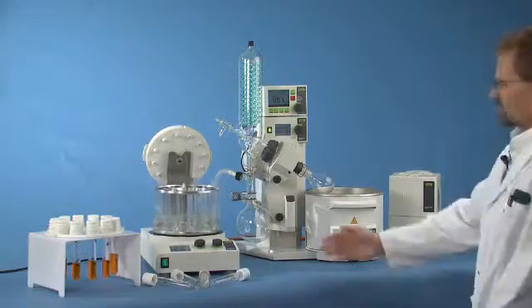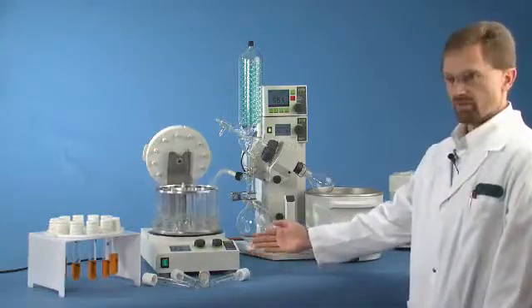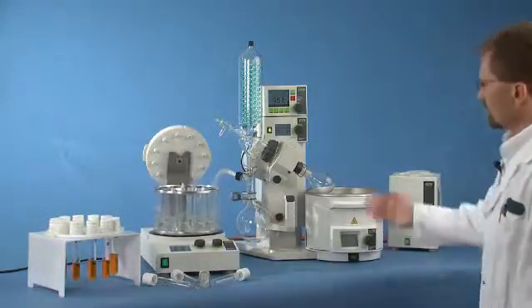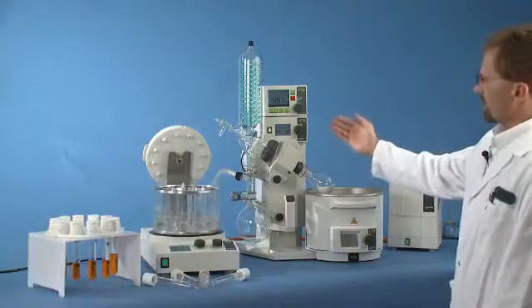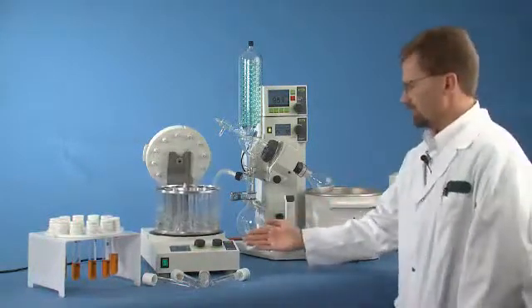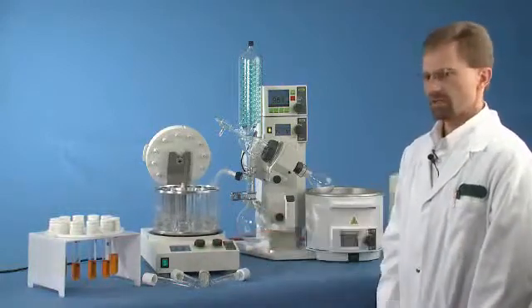So this allows you to minimize the amount of bench space required for your parallel evaporation. And secondly, since you already know how to operate your rotary evaporator vacuum system, the ease of operation for the Multivapor is simply set the temperature and adjust the rotation.